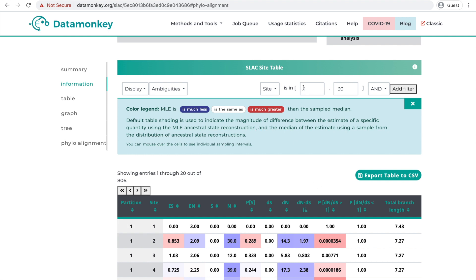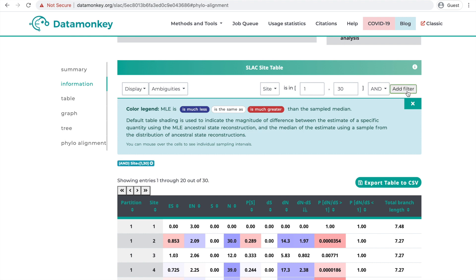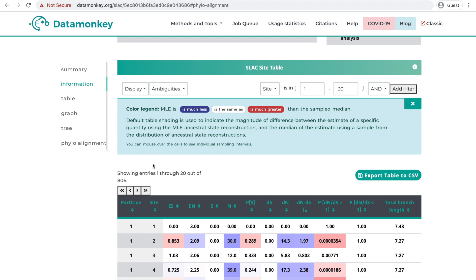So for example, if you want to just see sites 1 through 30, you can add a filter and you'll see that now we only have 30 sites. You can also remove this filter, and any filters you use will be saved when you export this table as a CSV.